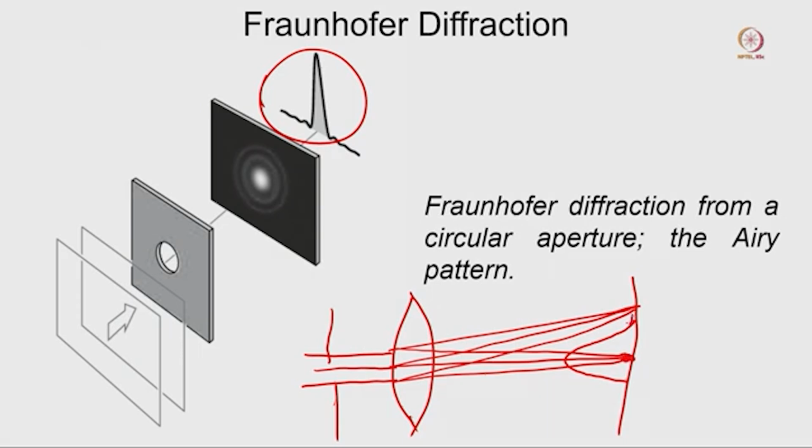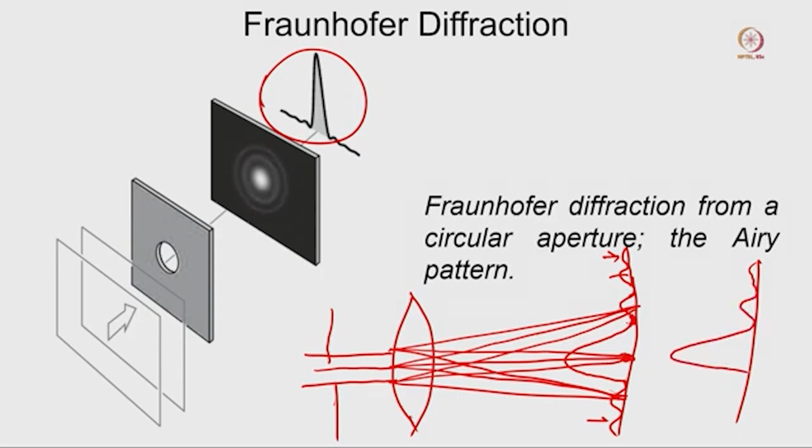Then there is a gap, there is a minima, and then again it is coming to one particular peak. So same thing is possible here. If it is coming somewhere here, these rays will merge and give us a peak here. So this is the first minima and then first maxima, and it will go like that. How many times it will oscillate depends on what is the intensity we are getting here after the diffraction. So if we just try to draw this one, what will we get? We'll get this kind of curvature. Okay, so this is for one source or one light.